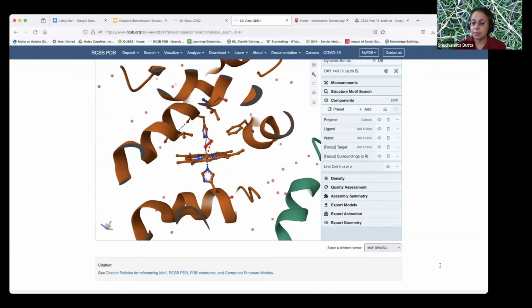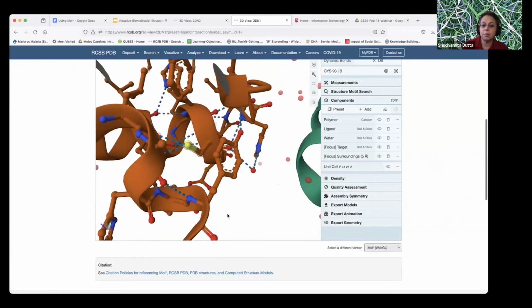And so a question that comes up in the chat here is, is this residue number the residue number of the full protein or whatever is in the structure here? You might encounter this, that the UniProt numbering, which represents the entire protein's numbering, compared to what is in the PDB structure, they don't always agree. And if there are differences, both numberings are denoted, one within a parenthesis. As we go through this, you might see examples. I hope that answered your question.